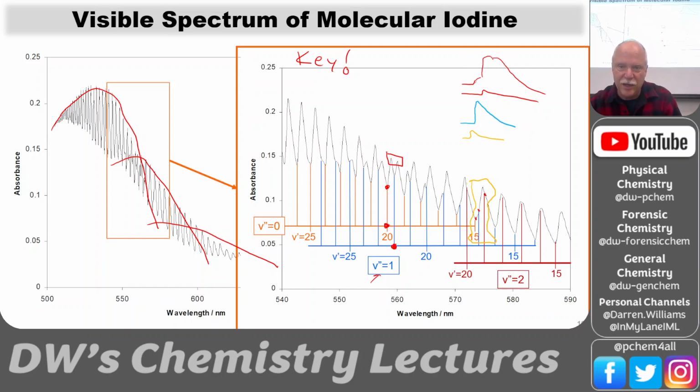So we see this little point right here, and we see this point right here. This one is easy to find, and then we see this one here, right here. So three places where the slope changes. That's the places we're picking.